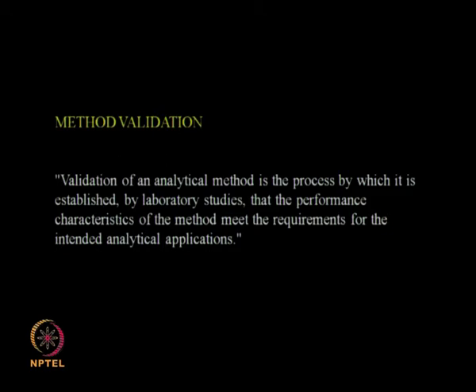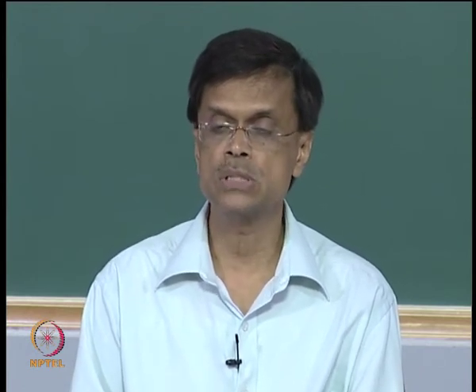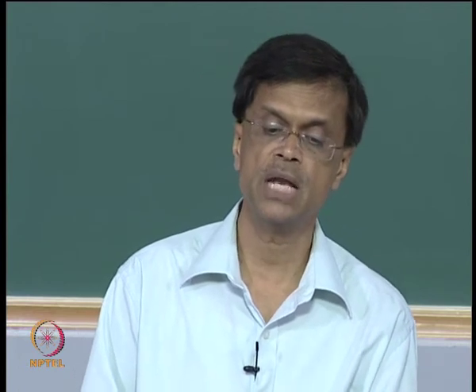That means if I am developing a method for measuring a particular metabolite in my mixture at a concentration of 0.1 millimoles per liter, then the method which I develop should be accurate enough to measure that particular concentration. That is what is called the method validation.